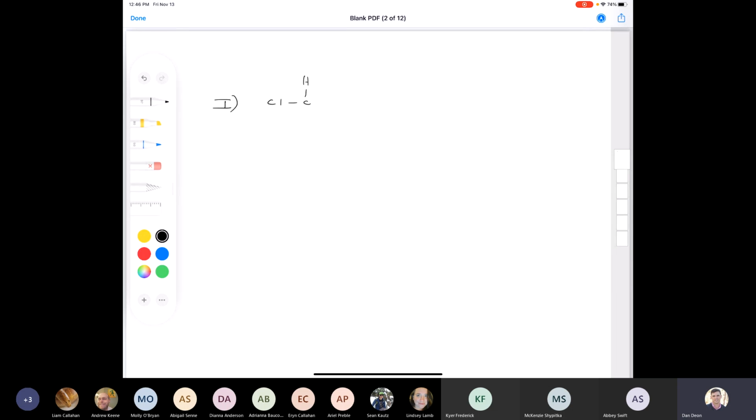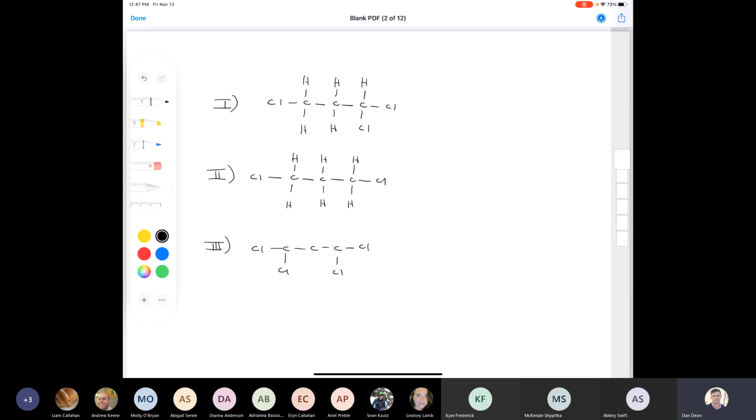So the first compound is this. Okay, and we're looking for compounds that have at least two triplets. Remember, the question asks, which of these compounds will show two triplets among other signals in their NMR spectra? So we're looking for two triplets. I'm going to give you a second to examine these compounds and see if you can figure out which ones have two triplets. Or maybe there's just one.